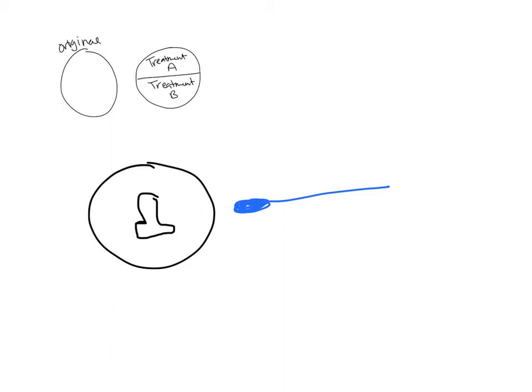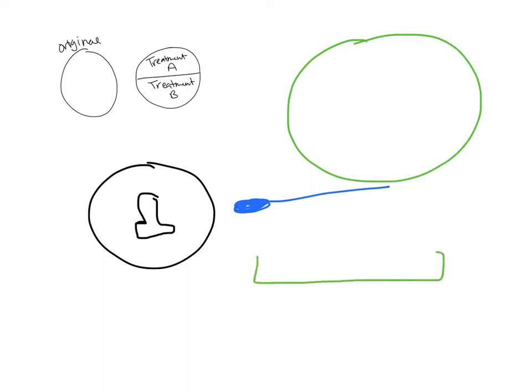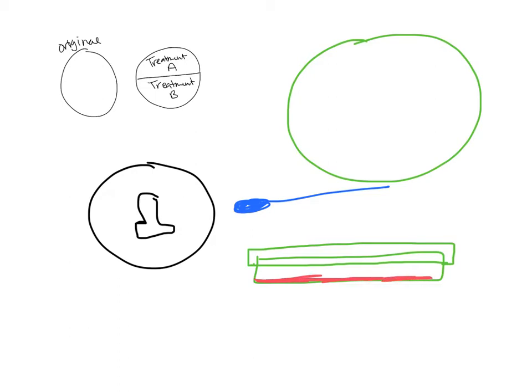So I'll make our plates green. So here's our plate. This is the agar plate. We're looking down on it. And if you look at it from the side, there's a top to the plate and then a bottom to the plate. So the top fits over. This is the top. It's the lid. The lid does not have the agar on it. The agar sits on the bottom of the plate. And that's obviously where you're going to spread your bacteria.